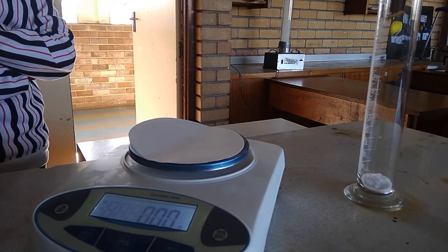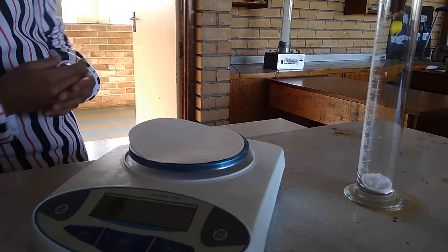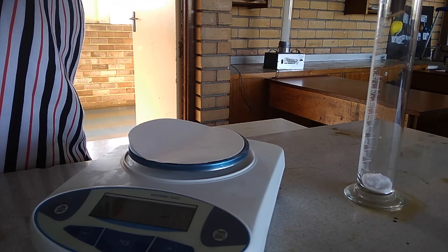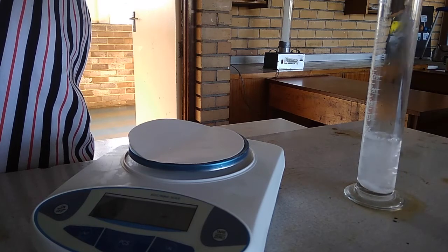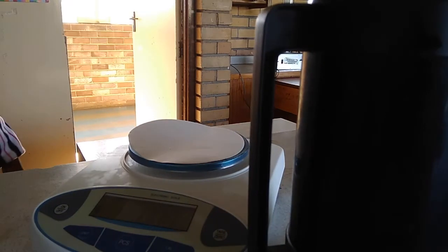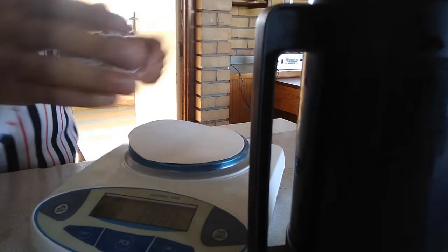No pressure. Won't you grab, I want you to fill that up to the top mark. Just stop 5 milliliters before the top, because we're going to show you how you can get it more accurately. No pressure. What you got? Must be accurate, right? Okay, and stop it. See, no shaking. We're shaking, you can see your hand do this. Shouldn't it be more, sir? Yeah, won't you put water in here?